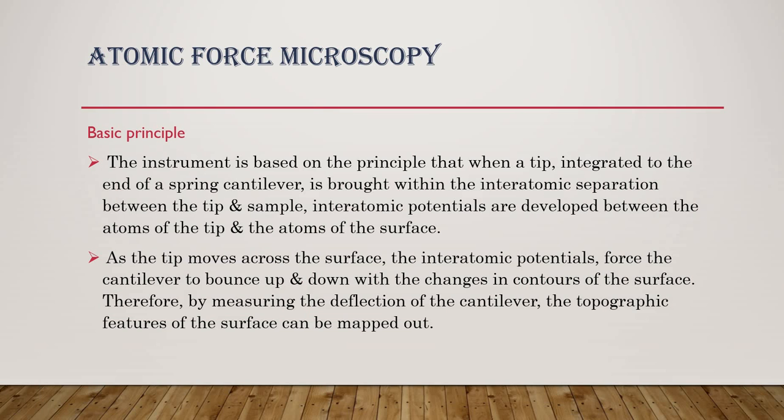Next microscopic technique is atomic force microscopy. The basic principle of AFM is used in surface sciences laboratories to obtain images with atomic resolution of 1/10 of a nanometer. This type of microscopy can be effectively applied in the field of polymers to study the surface characteristics of a polymer sample.